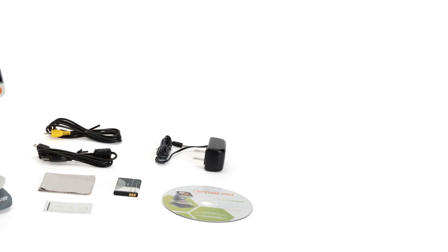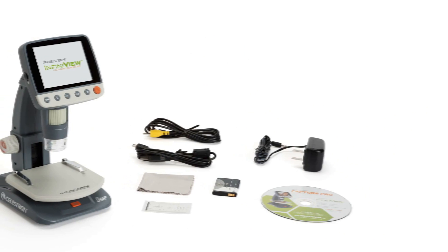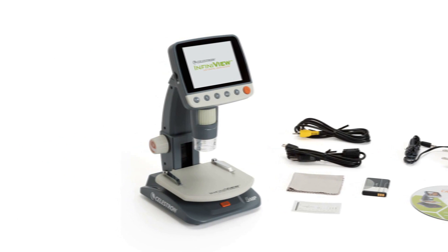InfiniVue includes a CD-DVD with Portable Capture Pro software and full instruction manual, a lens cleaning cloth, calibration ruler, USB cable, video out cable, and AC adapter.